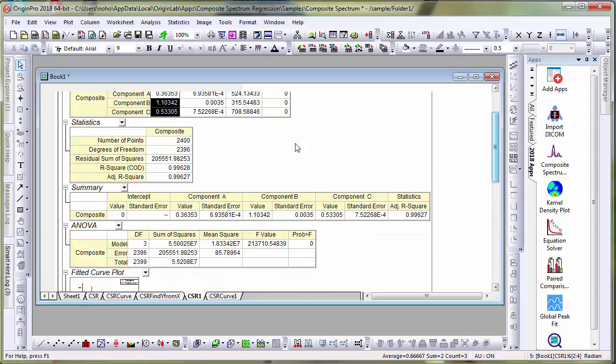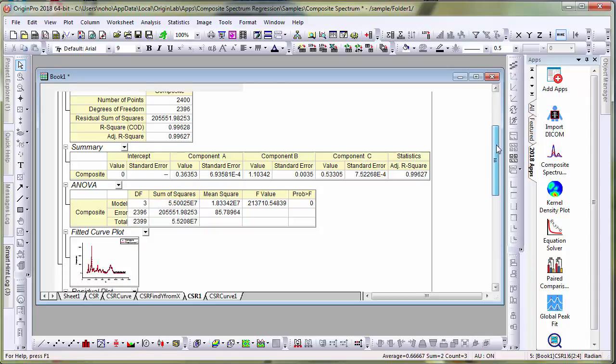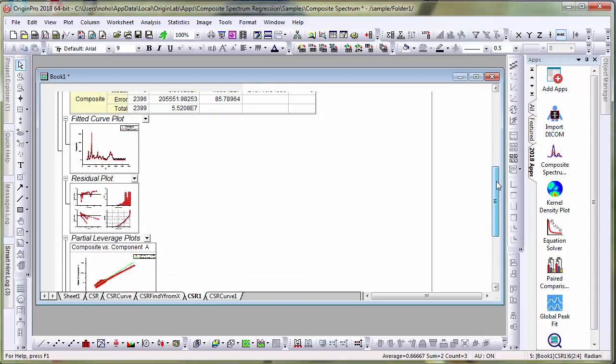And then the statistics, the adjusted R squared and the degrees of freedom and such. And the summary table, ANOVA table and individual fitted curves as well as residual plots.